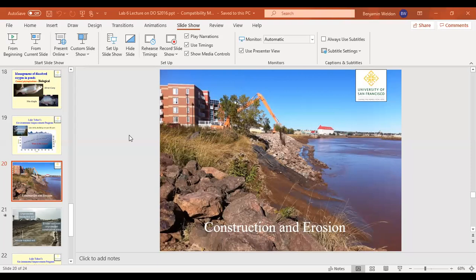You would have taken them immediately when you got to class, written down how many NTUs you got, and then each sample you would have shaken up, taken another reading, and that would be immediately after the storm event, and that would simulate your first flush event, so the first major rainfall of a season, and the construction site washing away all the loose sediment into a river, kind of like how this picture shows.